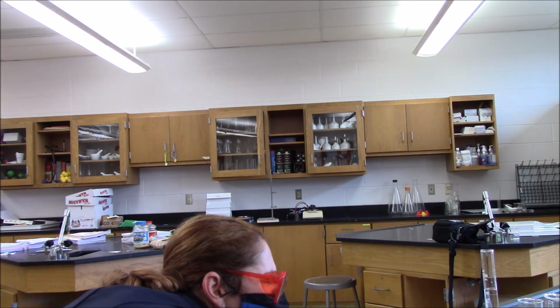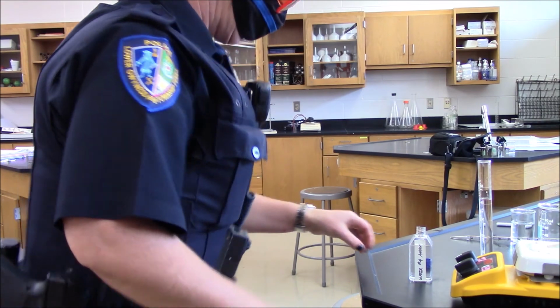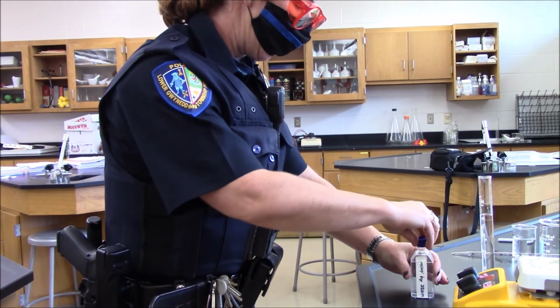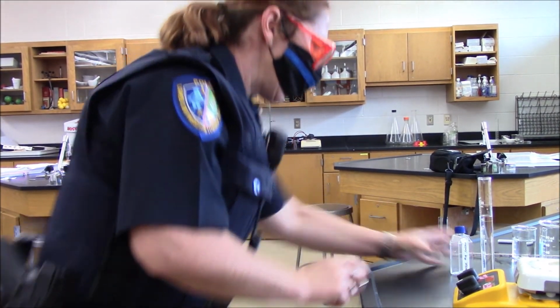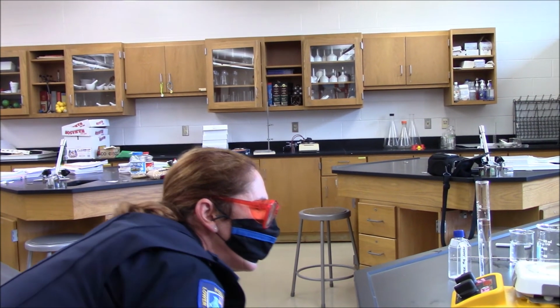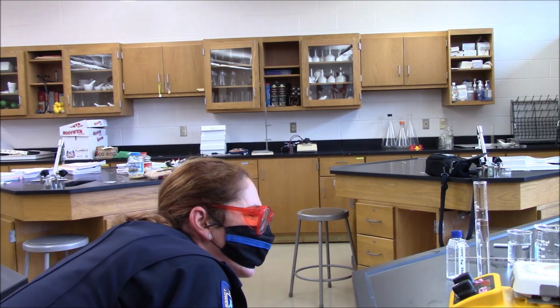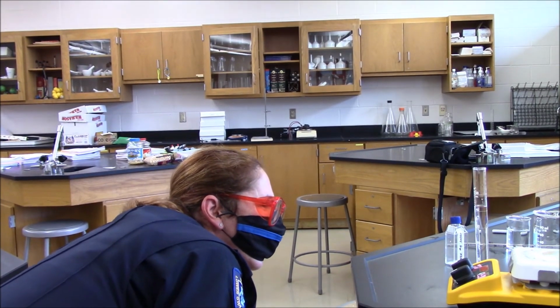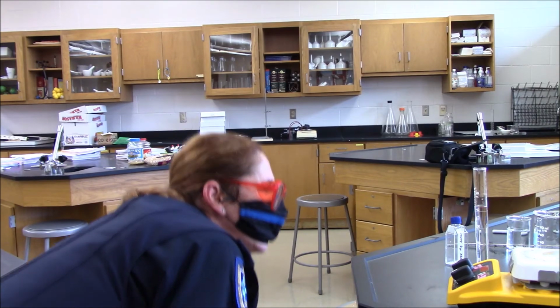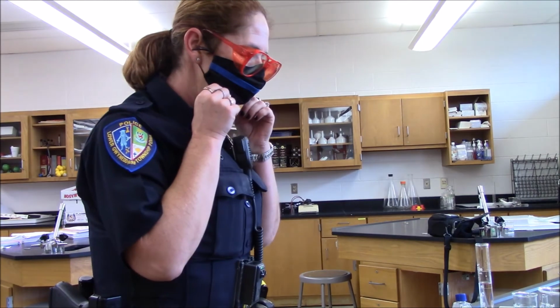Looks like we have 43, and we think it's exactly 43, so we'll say 43.0. I'm going to say the bottom of the meniscus is just below the 3. So, all right, how about this? Can we do 42.5? 42.5 works for me. Okay, there we go.